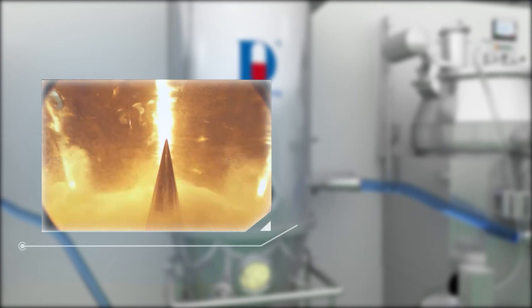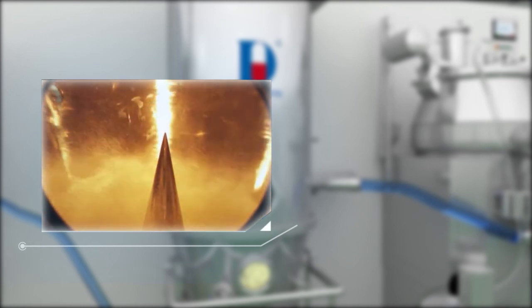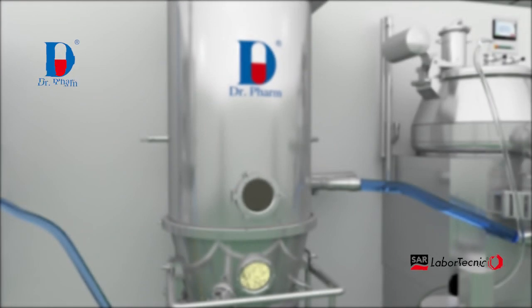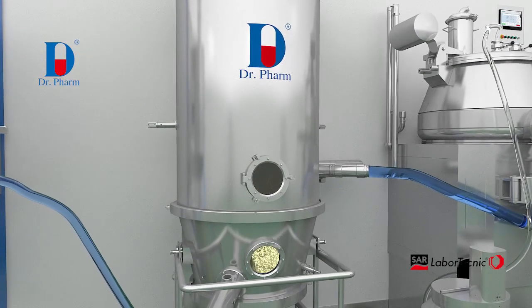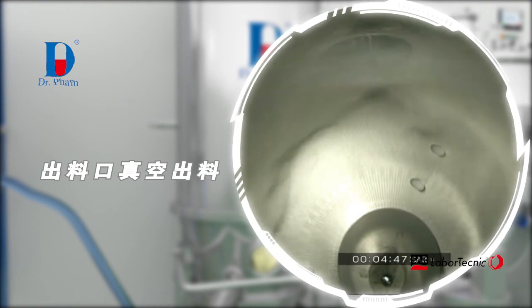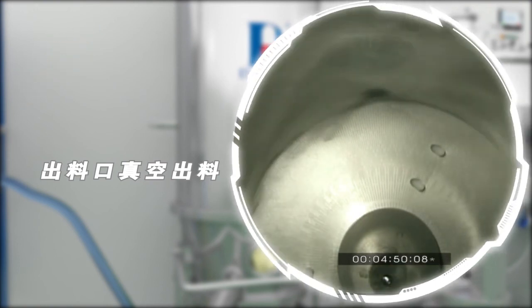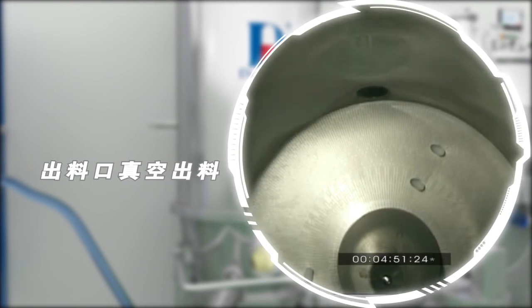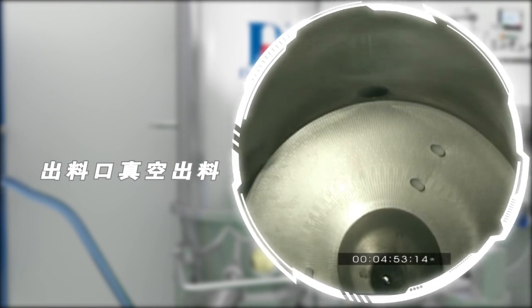When equipped with granulation function, the fluid bed is arranged with 45-degree spray guns to reduce the loss of the coating liquid. The higher capacity requirements for drying, granulating, and coating, the greater advantages fluid bed has, which can shorten the process time by multiple times.